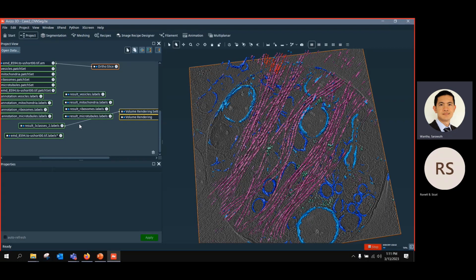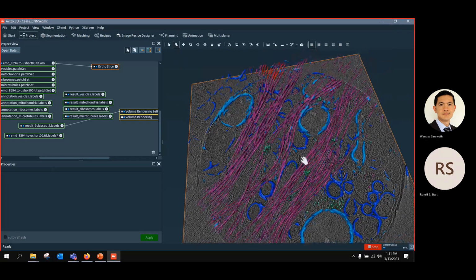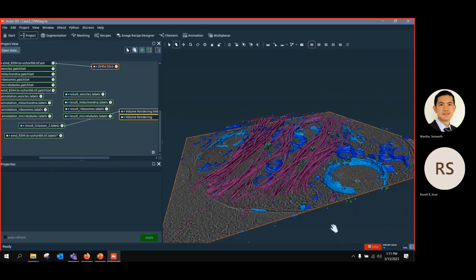I hope this helps. Can I just add a comment, since we're talking about hiring students? As mentioned, sometimes you have to do a lot of manual segmentation, and sometimes it's tricky to do it with just a mouse. So in the Viz lab, we actually have a new kind of pen and touch interface. You can use a pen to brush directly into your data. It's really helpful for speeding up manual segmentation. If you want to use that or learn more about that, you can send an email to help@viz.kaust.edu.sa.